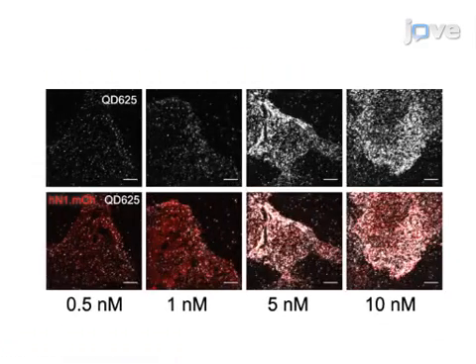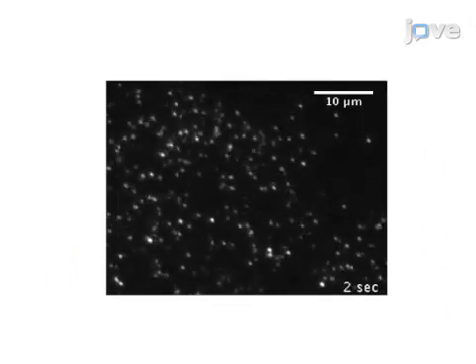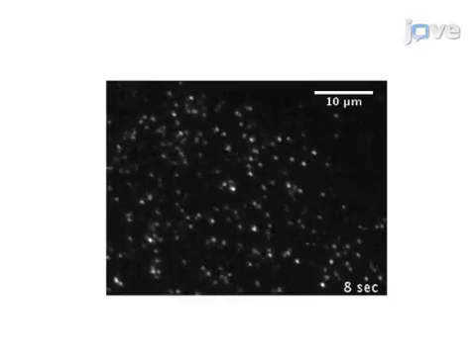The final step is to image the target protein distribution and diffusion trajectories via single-molecule fluorescence microscopy. Ultimately, real-time dynamic spatiotemporal information of target proteins in live cells is extracted to reveal how the target molecules work in vivo. The main advantage of this approach to synthesizing monovalent quantum dots is its simplicity and general accessibility.